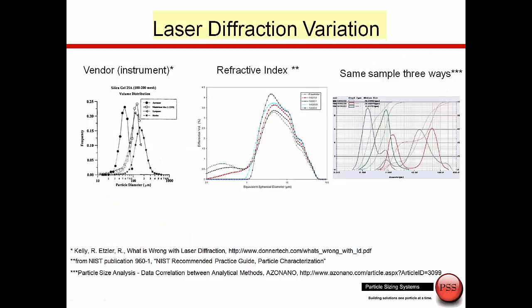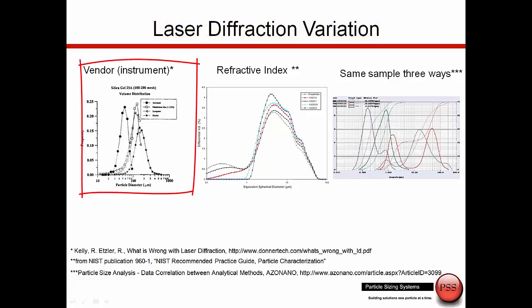And I'm going to show you a few graphs which help describe this challenge in data interpretation using laser diffraction. On the far left, we see the same sample was analyzed on various laser diffraction systems. And you see 3 different results depending on the vendor that was used, because these algorithms are very dependent on the maker, because this is essentially their intellectual property. They're saying our algorithm is the best.